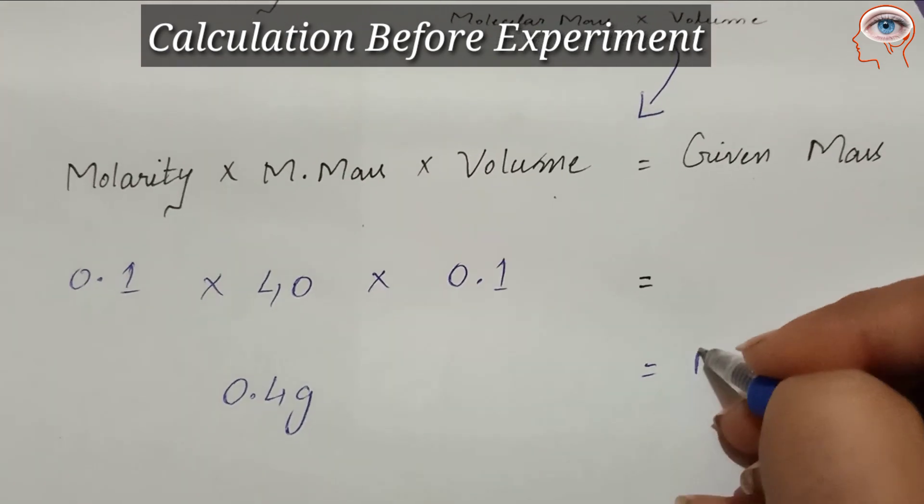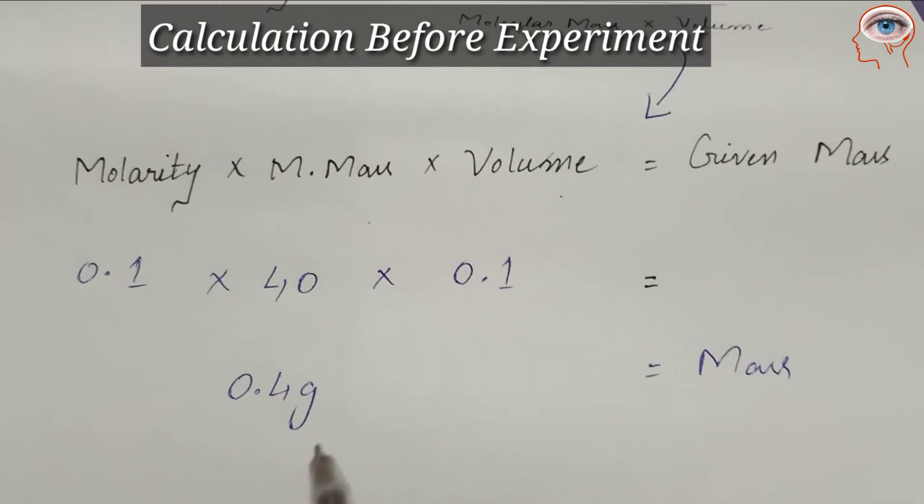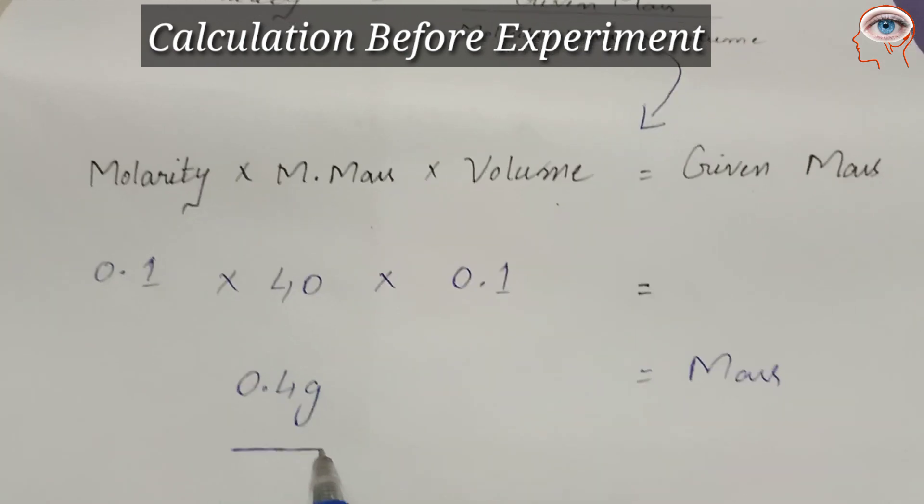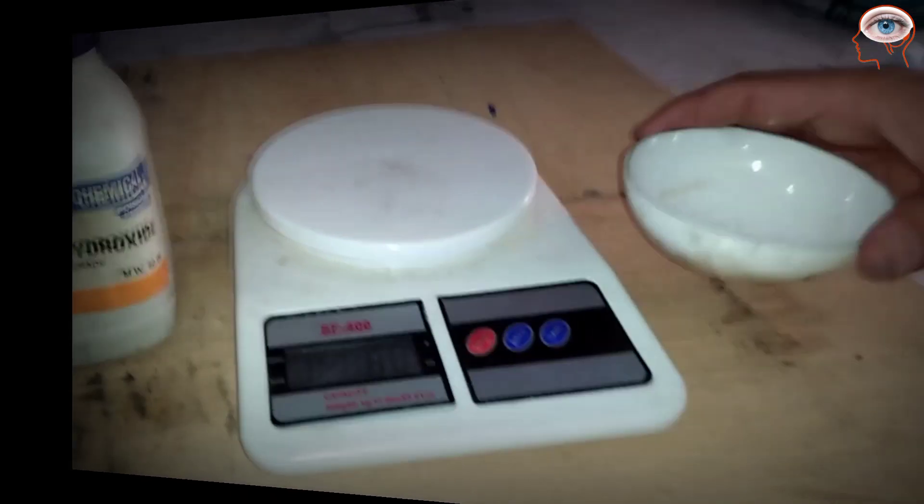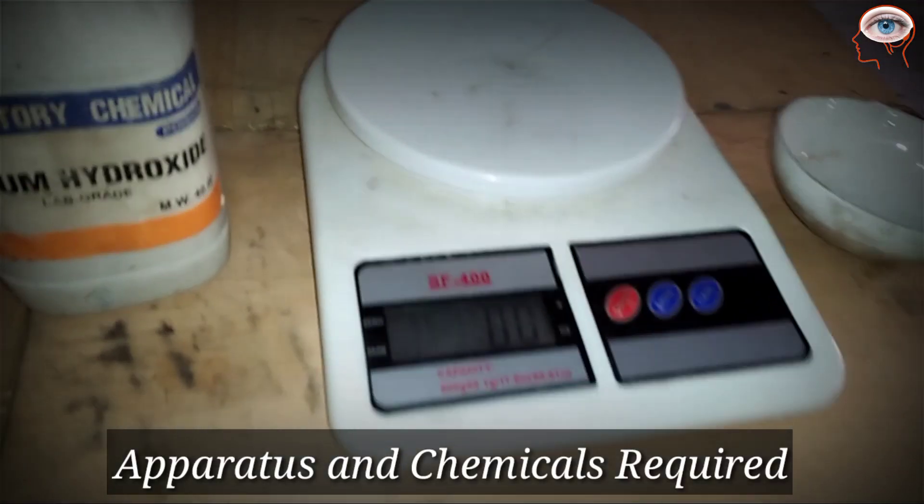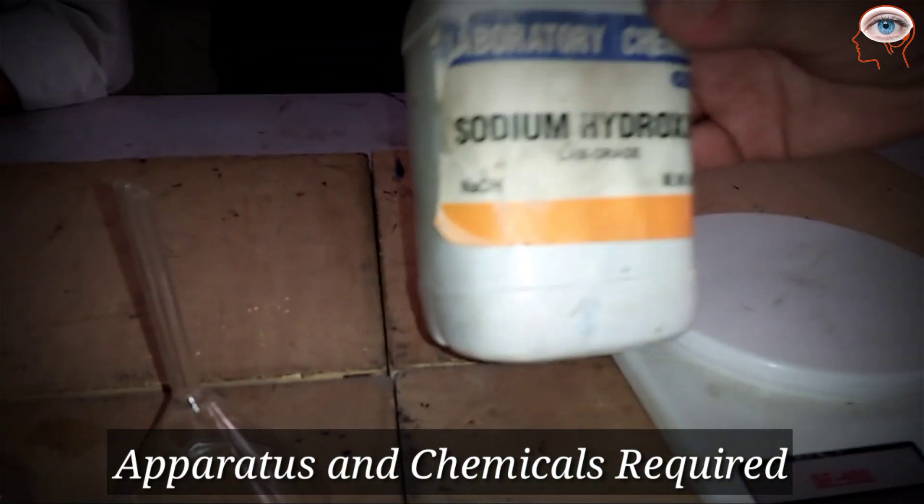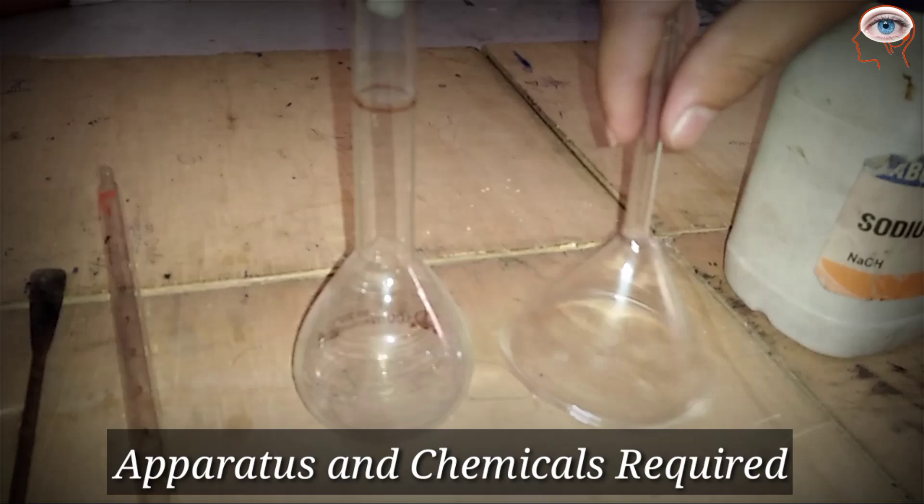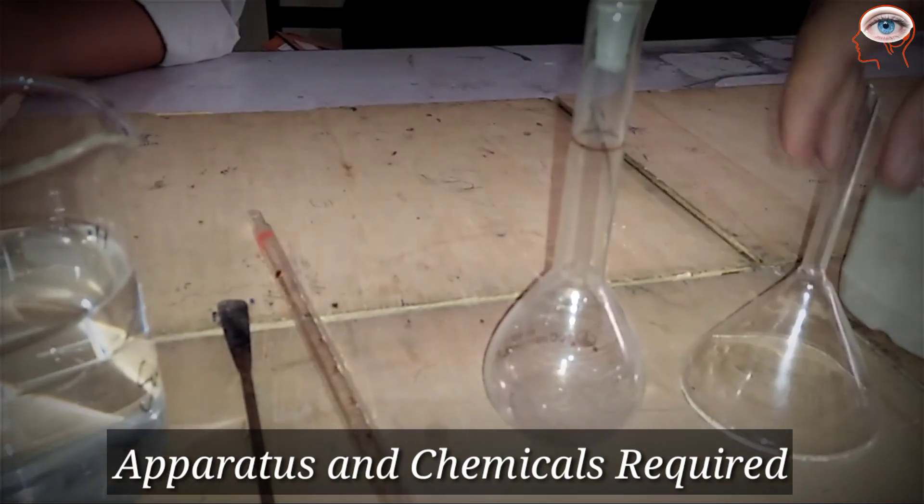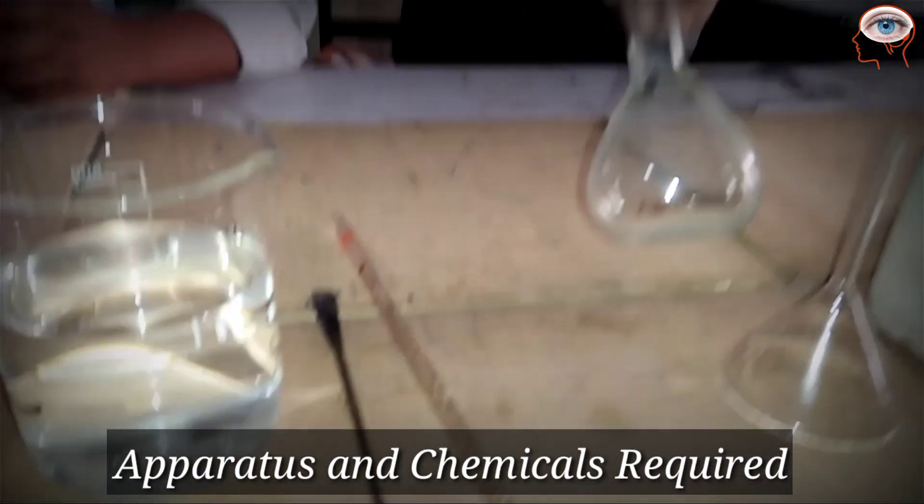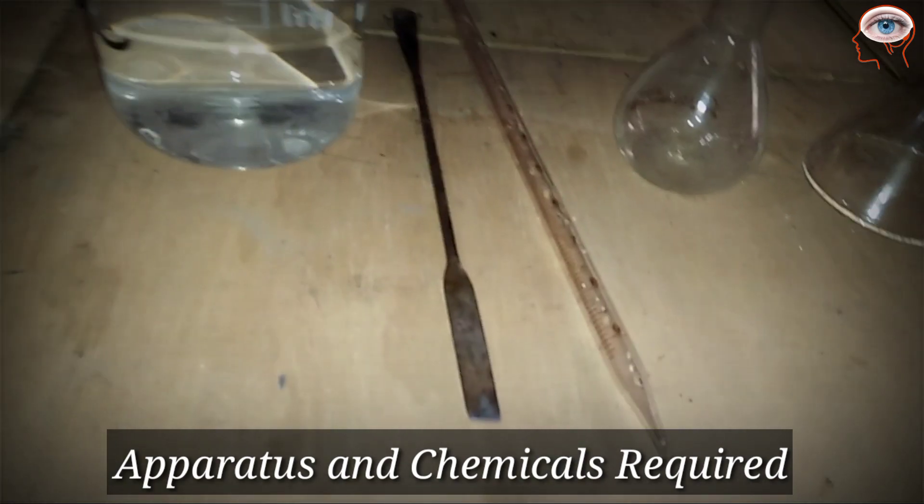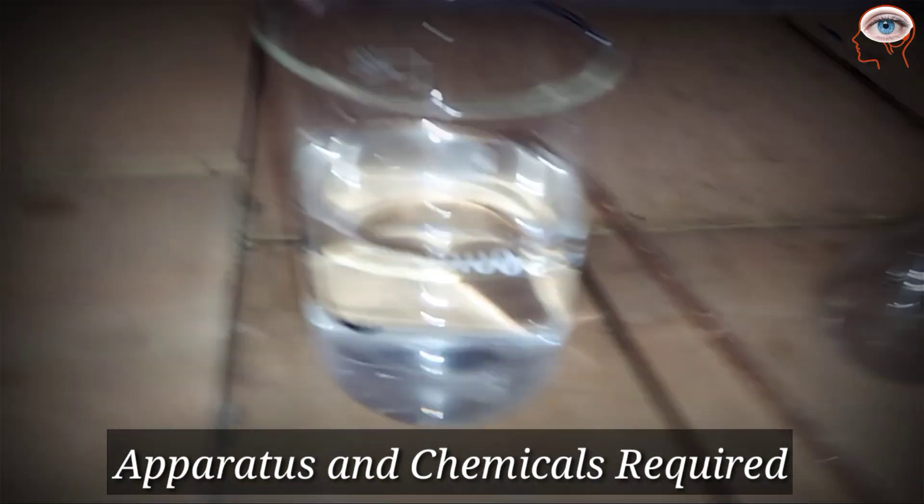Apparatus you need: china dish, electrical balance, solid sodium hydroxide, funnel, 100 ml measuring flask, pipette, spatula, and beaker with some water.